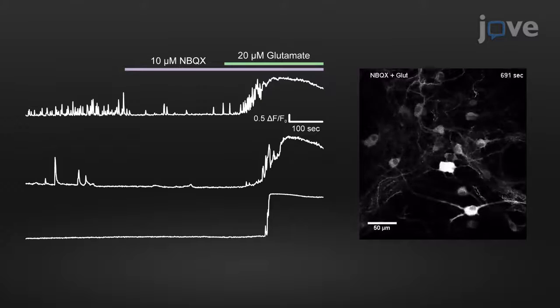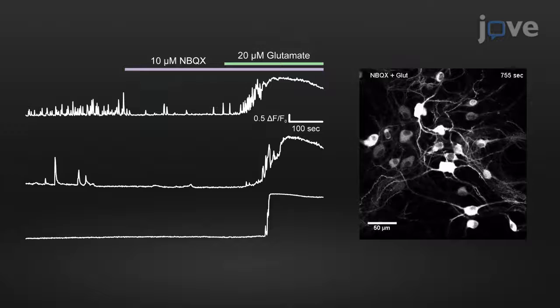This method can be used to dissect specific receptor contributions involved in calcium-mediated apoptosis. Our method provides an avenue for high-content drug screens to discover specific and effective neuroprotective compounds for Parkinson's disease. These neuroprotective compounds would prevent calcium-mediated apoptosis in dopaminergic neurons.